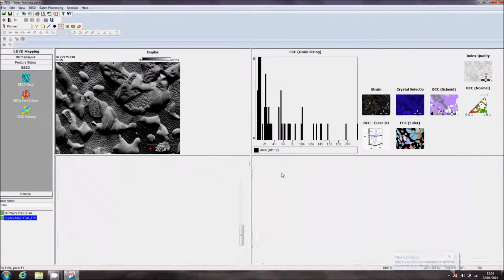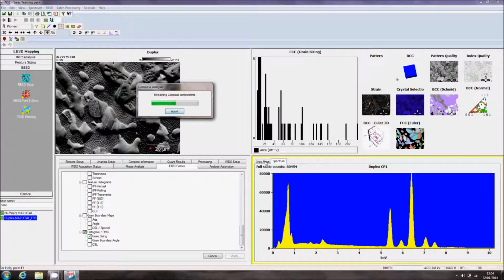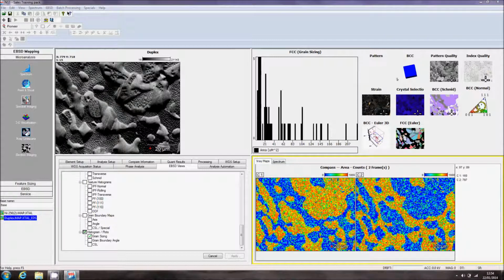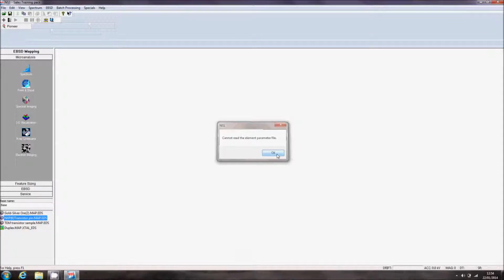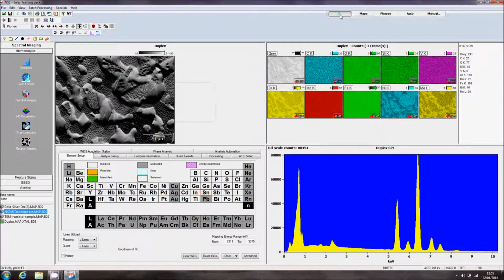One place we can really add value is on the EDS. So we click on the extract map image. We're going to pull out all the spectral information, and we're going to tie that through to the EBSD data. So if we go into microanalysis and click on spectral imaging, you may actually have this, it may not be in Compass when you first do it.